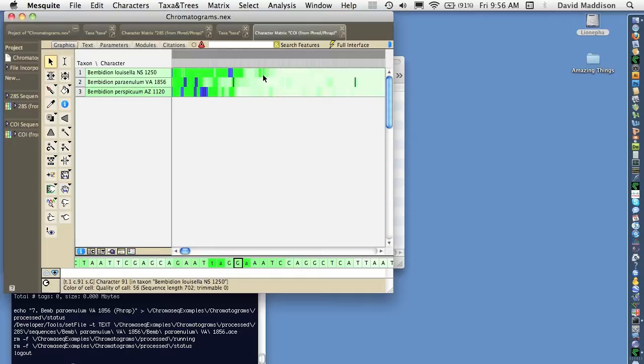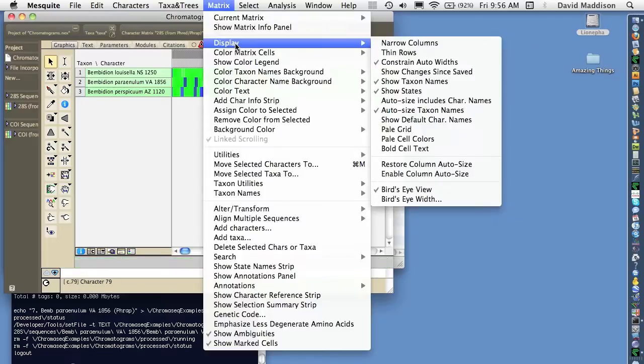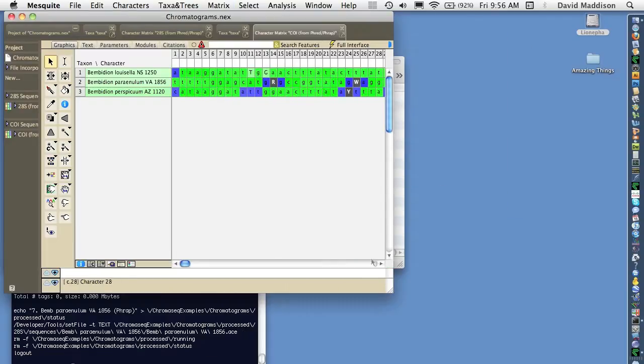We can't see the individual bases very well because we're looking at what's called the bird's eye view, as if from a distance. Let's change that so that we can see the individual bases.